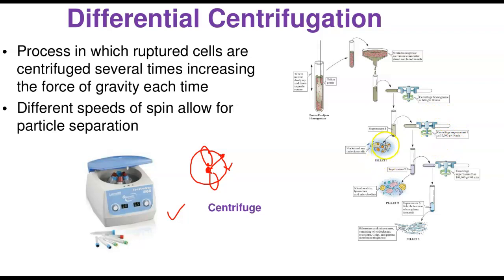What are you going to spin? You're not spinning your residue. You're spinning the supernatant. So you pour the supernatant again, balance it up in a centrifuge and spin it again. After spinning it for 5 minutes at 15,000 G, what happens again? You get another clear layer. This clear layer now, and then a debris, the debris or the residue.